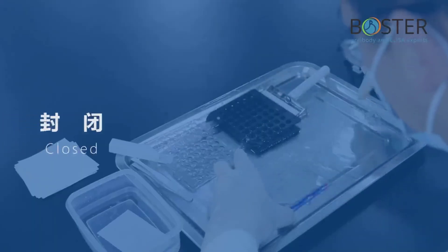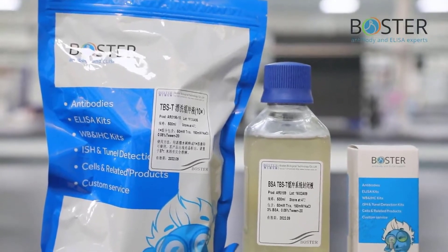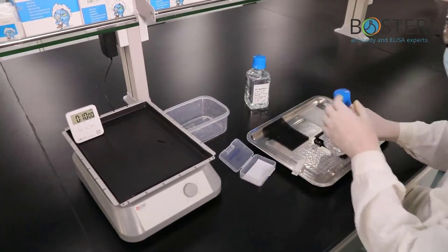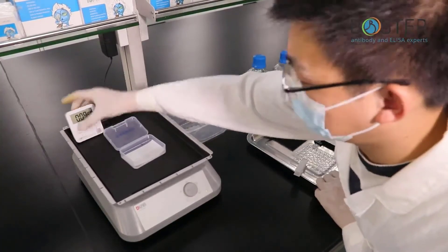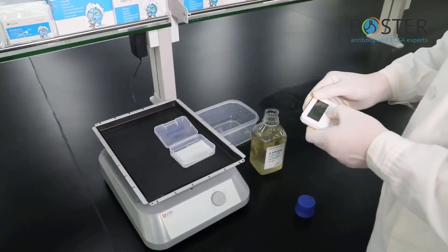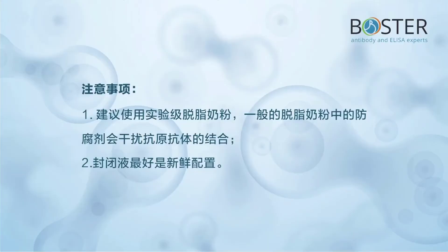Step 9: Blocking. These are the products needed for blocking. Take out the transferred NC membrane and put it in the washing solution. Wash for 10 minutes, repeat 3 times, then pour off the washing solution. Add blocking solution and block at room temperature for 90 minutes. Precautions: it is recommended to use experimental-grade skim milk powder — preservatives in general skim milk powder will interfere with the binding of antigen and antibody. The blocking solution should preferably be prepared fresh.